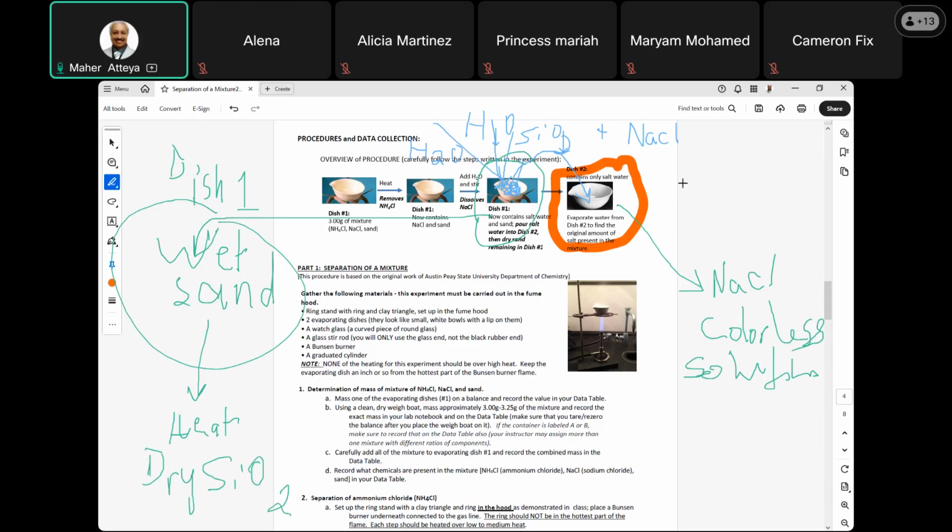Here I have a liquid solution. I have to watch. It's a sodium chloride solution. White crystals of sodium chloride will start forming and will start popping because of the vapor pressure of the boiling H2O, which will take those crystals up. So you put the watch glass on the top, correct? And you keep heating until everything is really evaporated in evaporating dish number two.